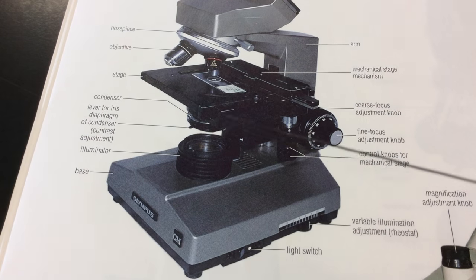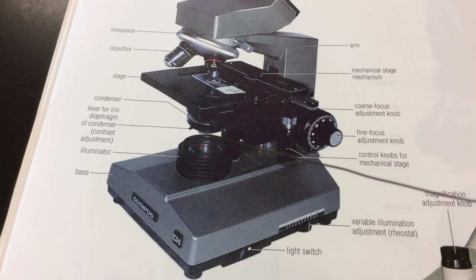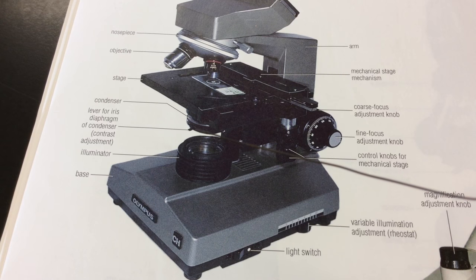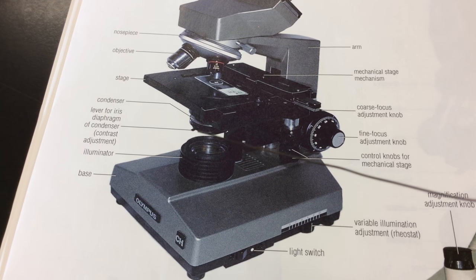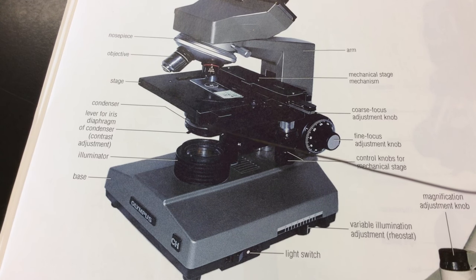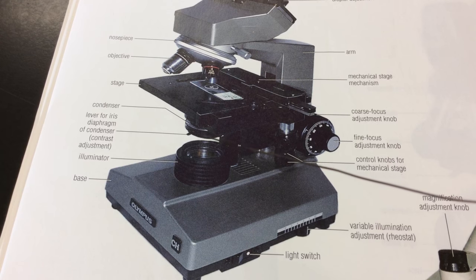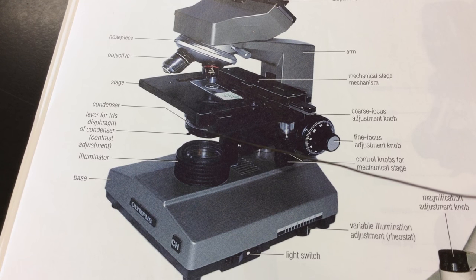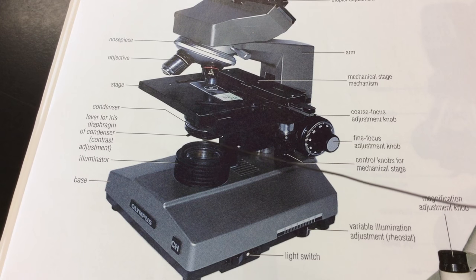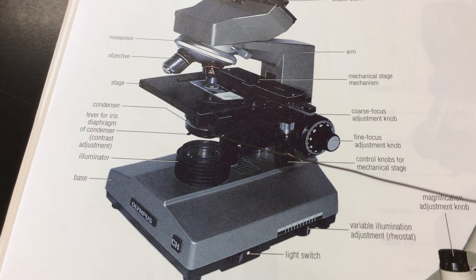Now, it almost looks like it's part of the substage condenser. We can see a little lever here. This lever is the lever that controls the iris diaphragm. And you can think of the iris diaphragm as a series of plates that you can open and close, very similar to the pupil of your eye. So when we want lots of light to strike our microbial specimen, for example, when you're using our oil immersion lens, we want to open the iris diaphragm to get as much light as possible striking our specimen.